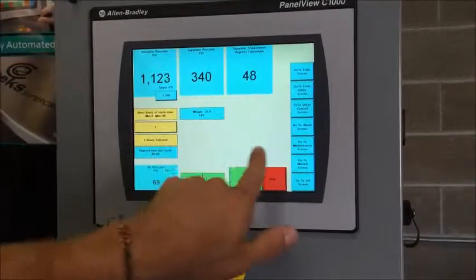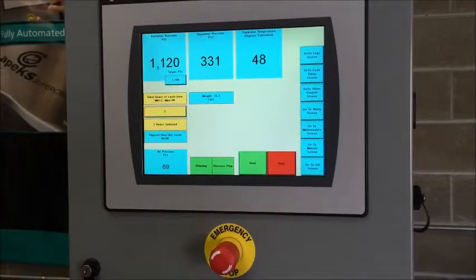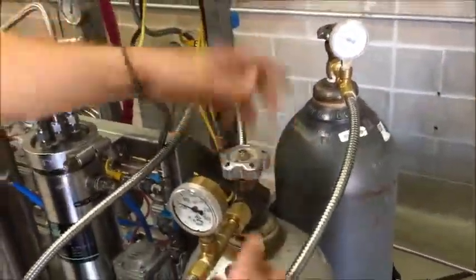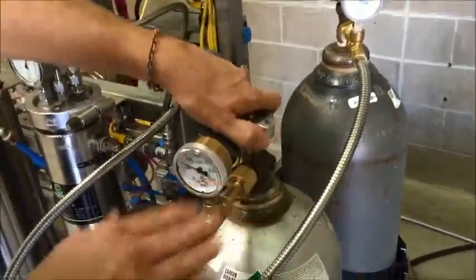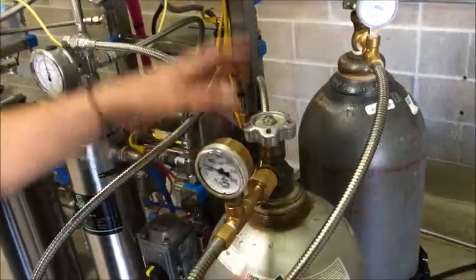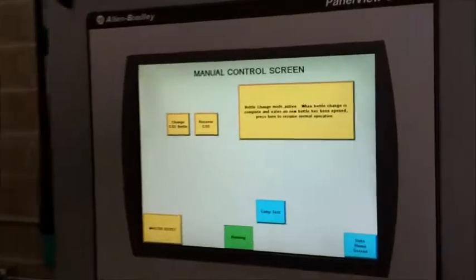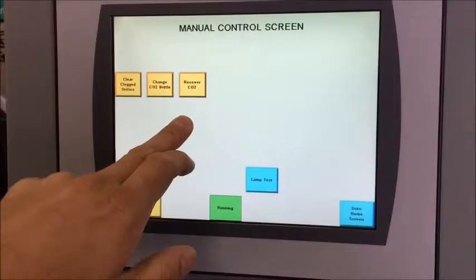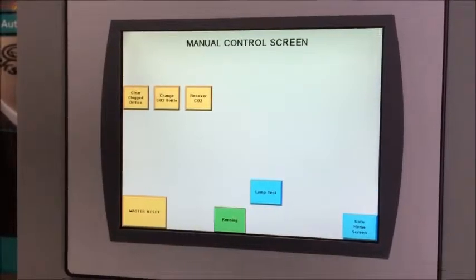The manual screen is pretty important. In this screen, at any point we can change CO2 bottles. If the system notices the CO2 bottles are low, a yellow box will come up here and remind you. You'll acknowledge that box and then swap out your bottles, or you can manually do it by hitting 'change CO2 bottle.' At that point you come over here, close the bottles and take them off — as you see, the system's still running, it doesn't stop the flow, but it does isolate the bottles. So you take these off, put new bottles on, open them back up. Once your new bottles are connected, come back over here — it just says 'when bottle change is complete, press here to resume normal operation.'